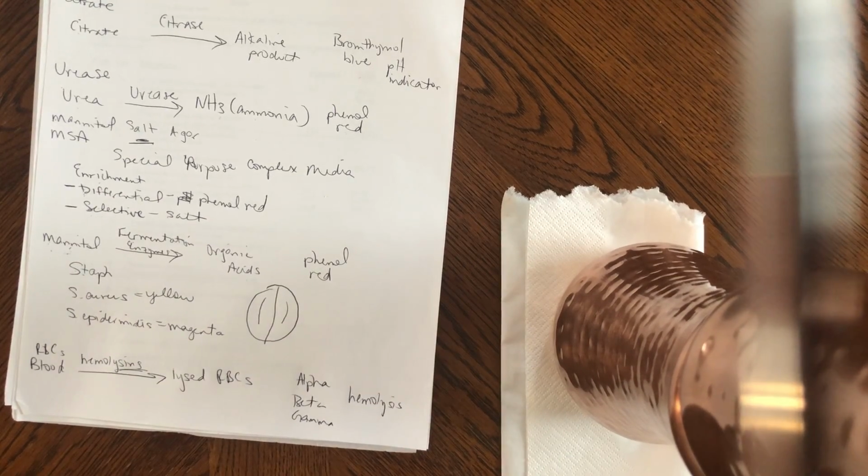Okay. Usually there's a handout that we go through with this lab, if you will. We would have swabbed our own throats, and we would have gone deep into our throats as if you were getting swabbed for a strep test or something. Those of you that have gotten a strep test before, you know how deep they have to go, and it's pretty uncomfortable to do. But we were going to grow our own throat bacteria. And depending on what kind of bacteria you naturally harbor in your throat, we would have seen either alpha, beta, or gamma hemolysis. Probably a combination of two of those three, maybe.